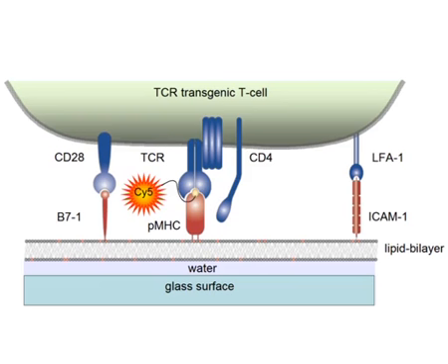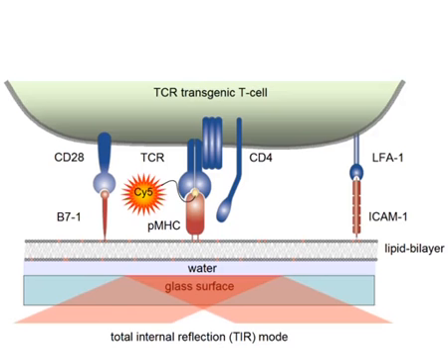of biological systems. Due to the nature of the planar system, fluorescence events can be monitored in total internal reflection mode, which cuts down cellular background substantially and is hence very well suited for single molecule fluorescence microscopy.